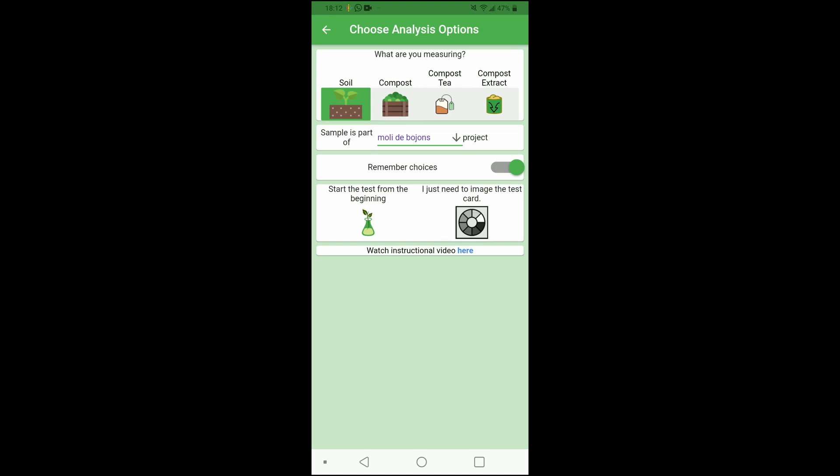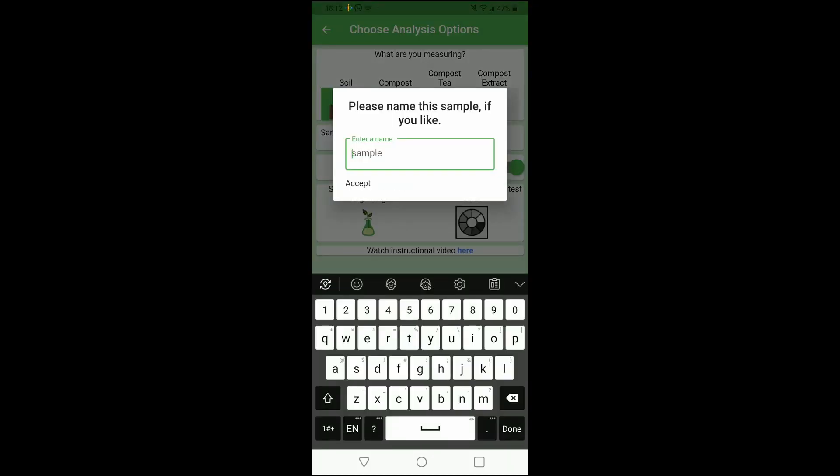There are some options at the top as well — whether it's soil, compost, compost tea, or compost extract — but we just sampled soil and that's already selected. I put in the name of my project and selected to remember my choices. I'm going to add the name of the sample, and this one is 'Puente,' because I picked up some sand and stuff near down by the bridge at the base.